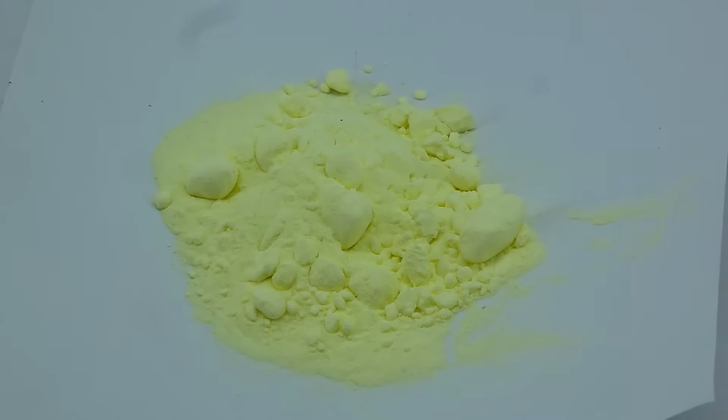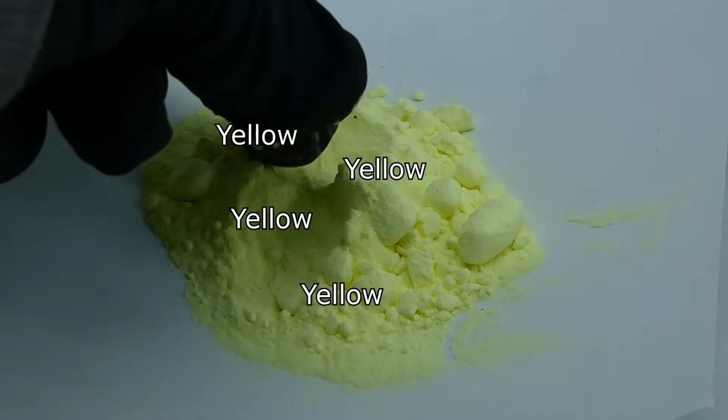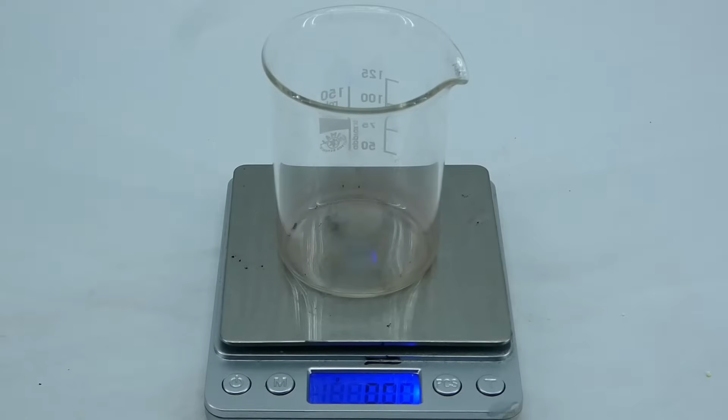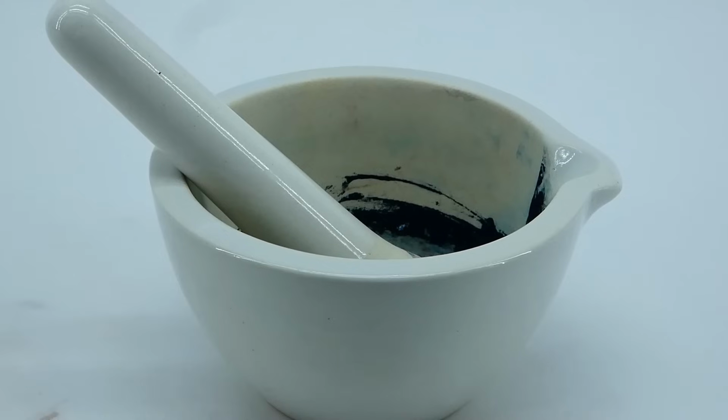There is a solution to this problem, which is very stinky, and it basically involves the use of a lot of sulfur. I won't go into much detail about why the sulfur is necessary just now, and instead I now have to weigh out the ingredients.